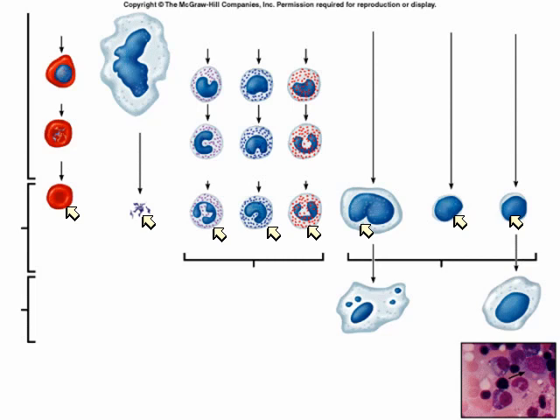On the right-hand side of that same table, table 37.2, you can see what neutrophils fight. All of these white blood cells aid you in body defense and some in immunity. The neutrophils help to fight bacterial infections. Their levels get elevated during stress. The lymphocytes, you can see that they help to fight viral infections. They produce antibodies. Monocytes help to fight fungal infections. They actually are some of the major phagocytes of the body. And the eosinophils and basophils, you can see what they might fight.